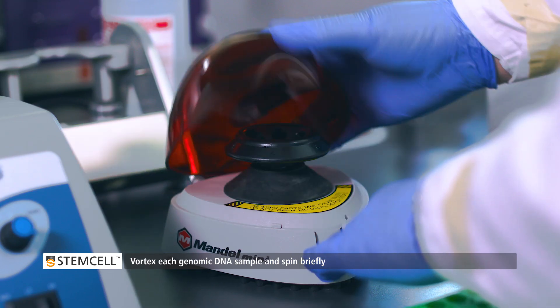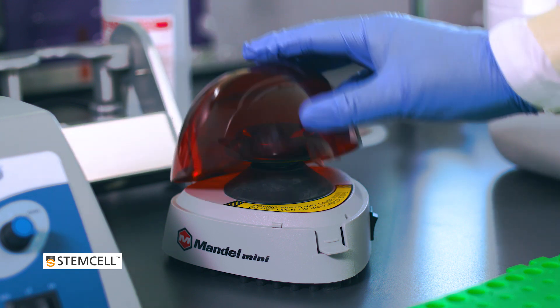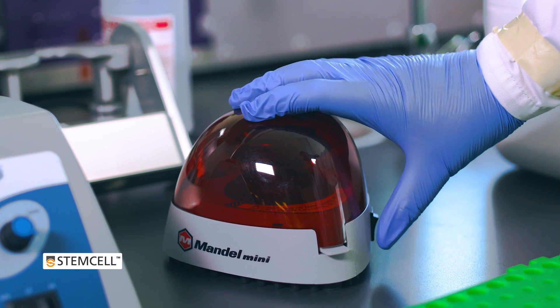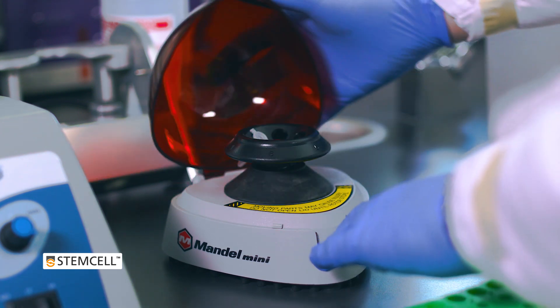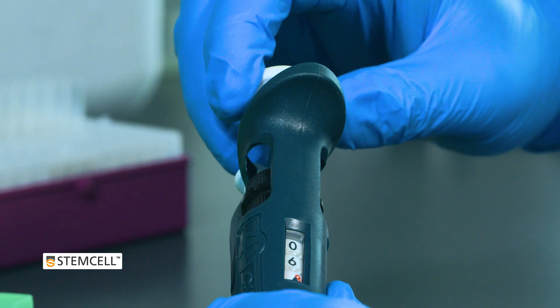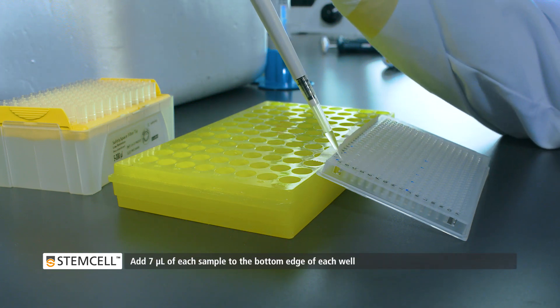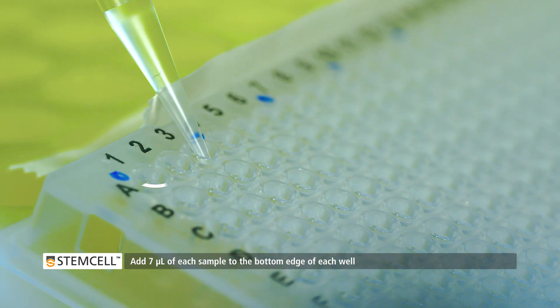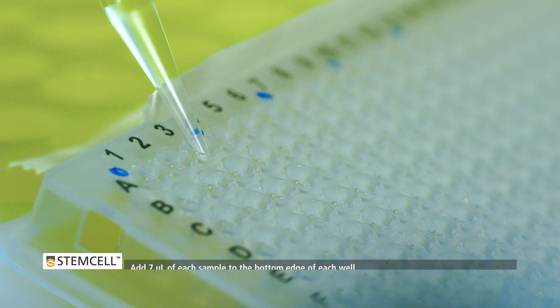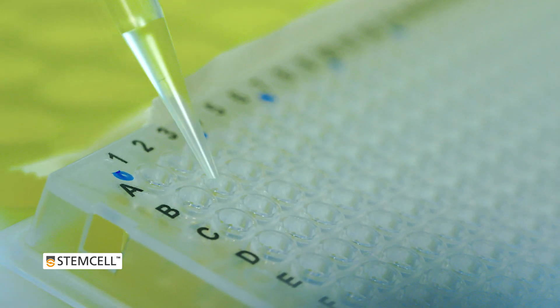Vortex thoroughly and spin briefly. Then, using a manual or multi-dispense pipet, add 7 microliters of the sample to the bottom edge of each well, keeping within the marked 3 by 9 well boundary. Repeat with each genomic DNA sample until all samples have been loaded onto the plate.